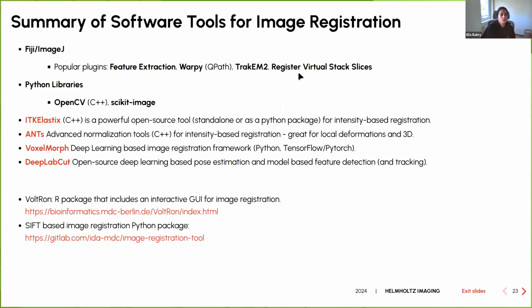So just to summarize, we already talked about those software tools, but I just want to mention here the most common software that people use for image registration. If you come from the field of biology, microscopy, and stuff like this, and you don't have any programming experience, there are plugins that are pre-installed or that you will need to install in Fiji that will facilitate your registration. Those are generally found under the plugins and in the feature detection or registration, and you can see examples here.